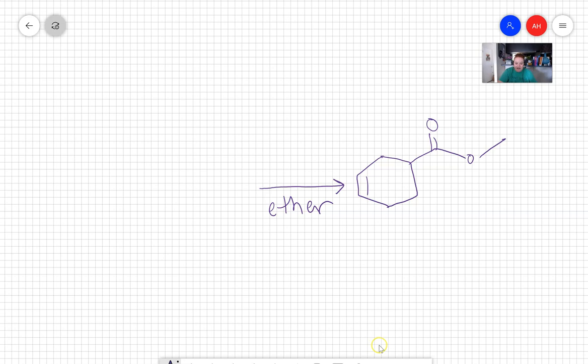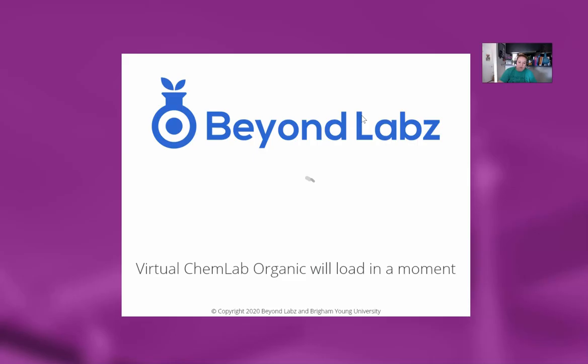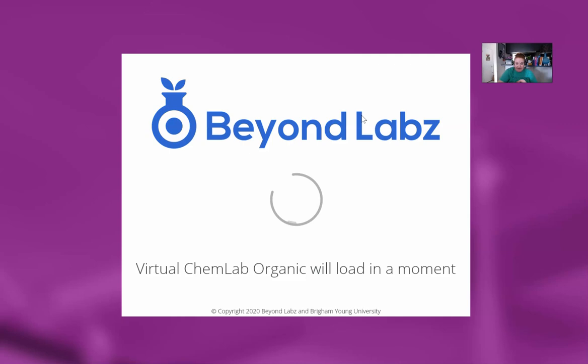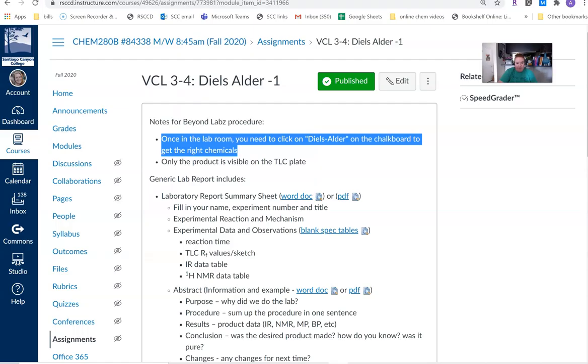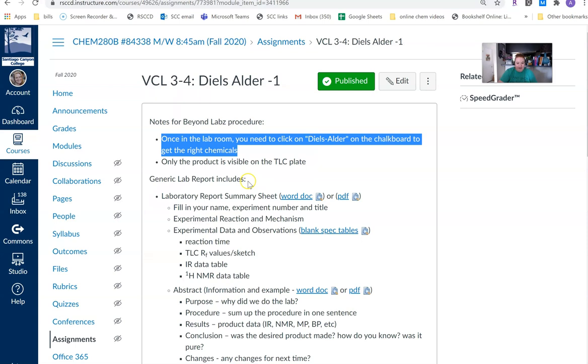So we need to figure out what our starting materials are based off of a couple things. We're going to base it off of what's available in our lab room. And we're going to base it off of the fact that this is a Diels-Alder reaction. So I'm opening up my software here. I'm going to go into that diene section again and then the 3-4 reaction. And then while I'm doing this, I'm also going to go open up the lab assignment on Canvas.